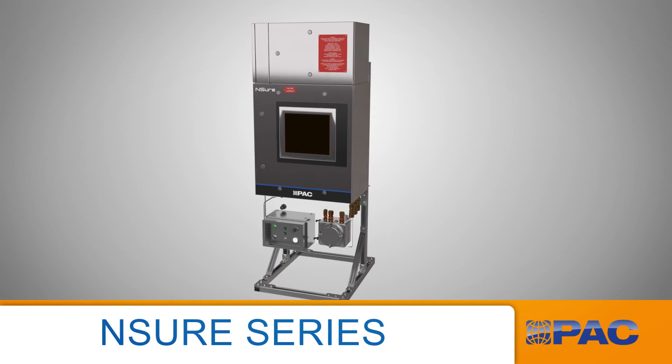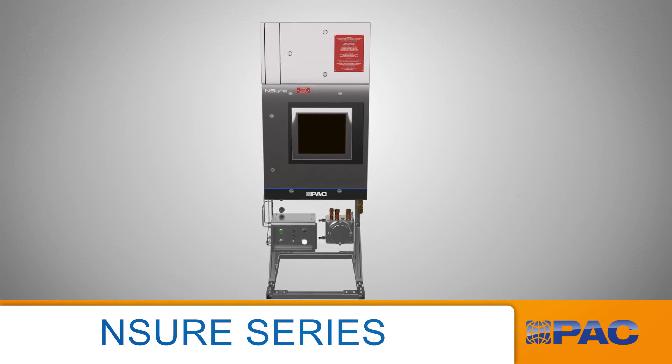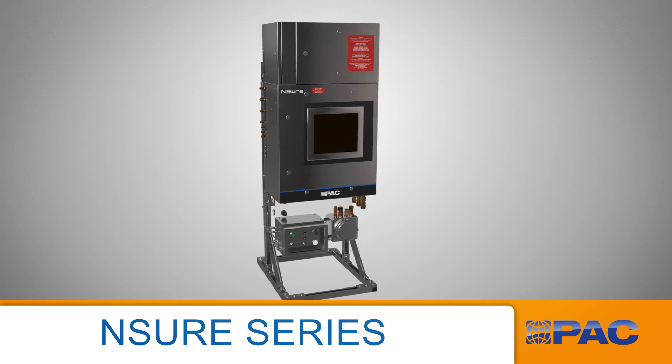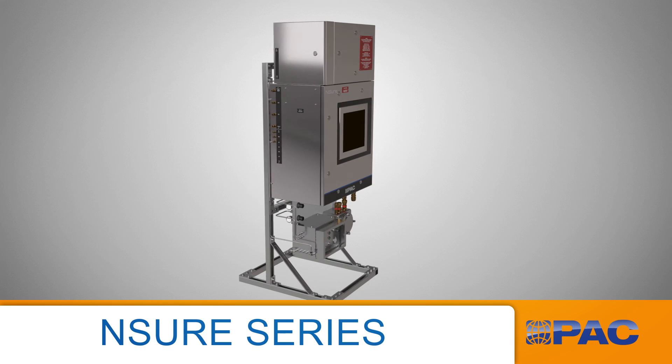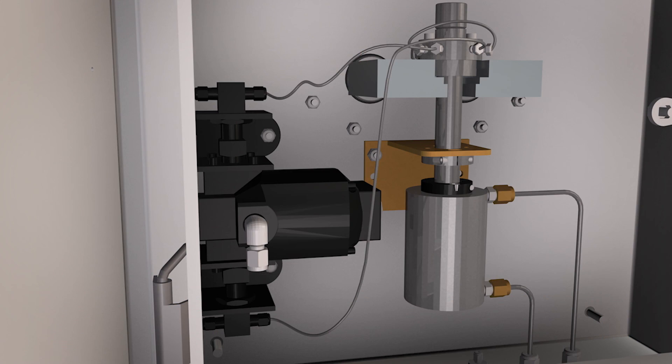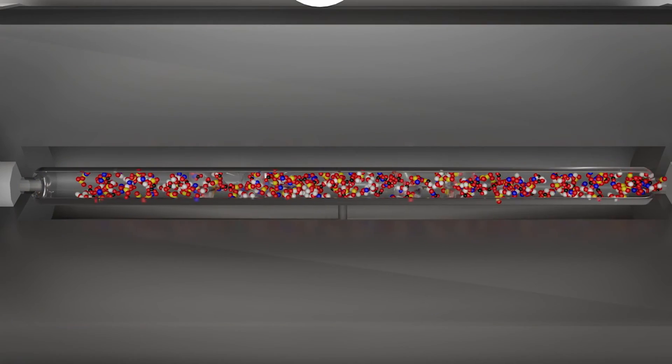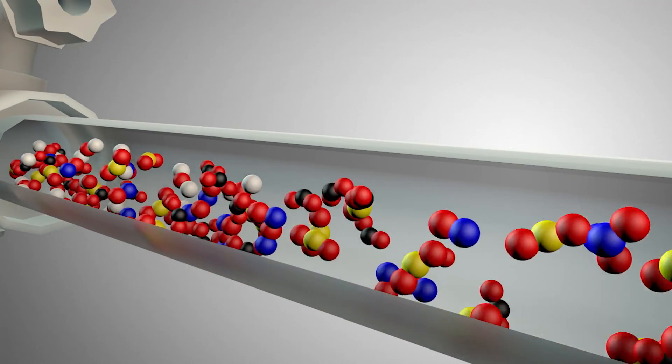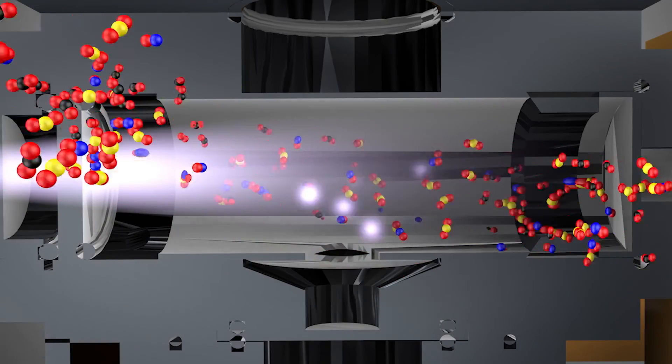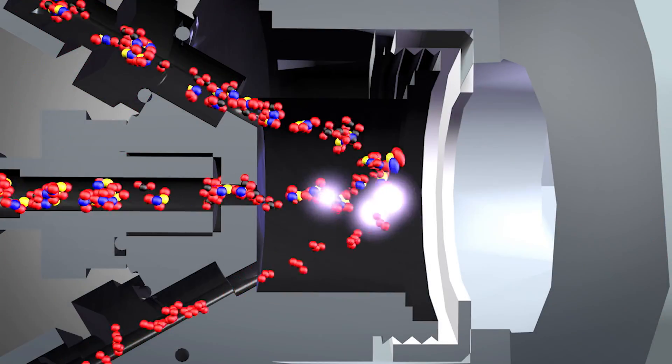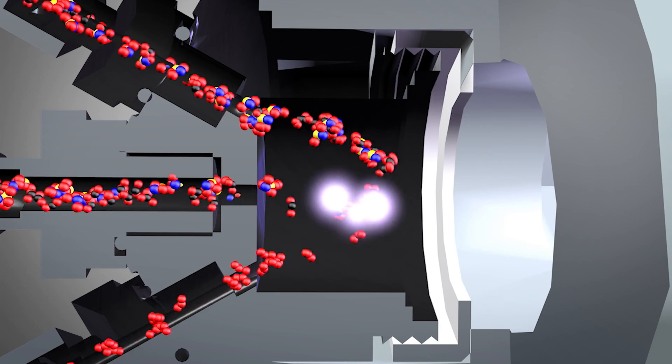Ensure is a process sulfur and nitrogen analyzer with unique technology that ensures you will meet the specifications for your products. This video will demonstrate the unique technology that facilitates fast results from diesel to LPG, as well as the detection methods used to measure sulfur and nitrogen. At the end, you will understand the path of the sample from introduction to measurement, as well as the advantages of Antec technologies.